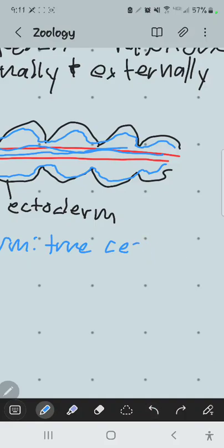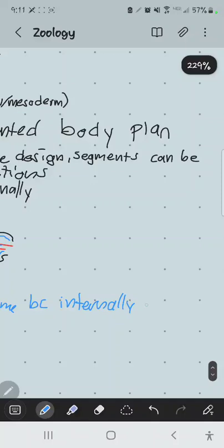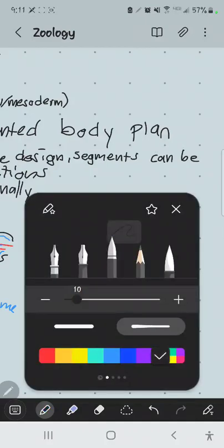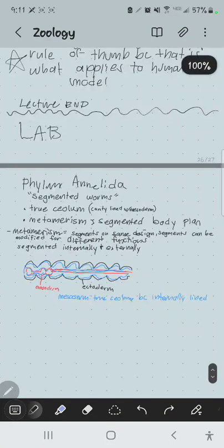All right. So we're going to do a worm dissection today, and we'll see this internally. But I also have some cross sections to look at. This is a slide of the worm cross section. There's an earthworm internal cross section here. There are also some leeches on there too, but you have to pay attention to which ones you're looking at.